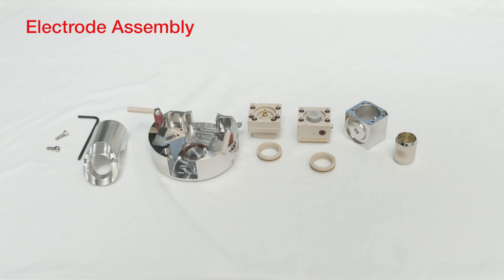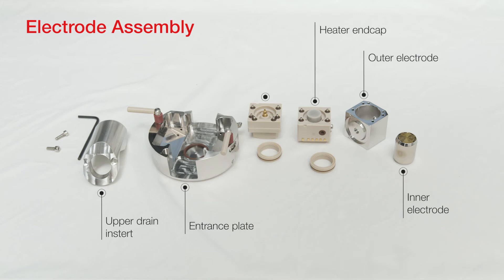The electrode assembly consists of an upper drain insert, an entrance plate, inner electrode, outer electrode, heater endcap, RF endcap, and two electrode bushings. If the medium-sized O-ring on the entrance plate should come off with the electrode stack, simply place it back onto the entrance plate. However, if the small O-ring should fall from the endcaps, they will need to be reinstalled. Please note that the O-rings that face the electrodes are a different size than the O-rings on the sides of the endcaps.